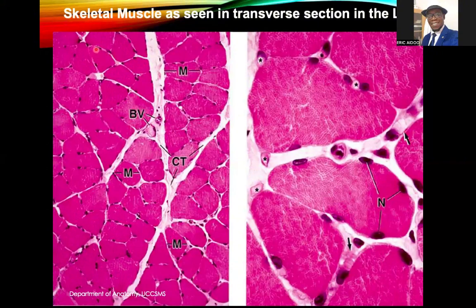You can see the nuclei at the periphery. If you take just this muscle fiber, you have at least one, two, three nuclei. So that is what's meant by multinucleated. And the nuclei are at the periphery or superficial position. We have to appreciate that.